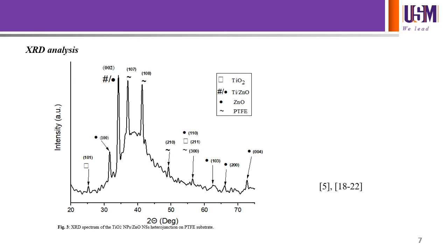In the seventh slide, the XRD analysis allows for the interpretation of the peak properties of the grown heterostructure on the PTFE substrate. As can be shown in figure 3, the peaks of the used components were joined to Miller indices. The names of the used components labeled in the figure can be seen at the map guide of materials on the right.